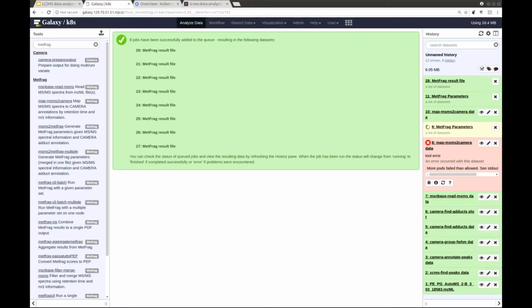Okay, we have another question. Why do you focus on this cloud computing setup when there are publicly available Galaxy instances, such as usegalaxy.org or galaxy.eu? So one scenario is that you might be a hospital, and in the consortium we have the Uppsala Hospital, and we also have Imperial College with a medical facility. When you're talking about human patient data, things become very sensitive.